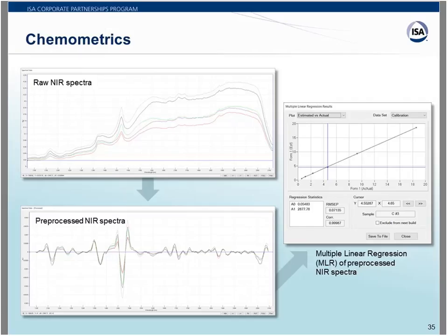These spectra might make no sense at first to someone who wants to quantify the moisture content during a manufacturing process, and it would probably be unrealistic to interpret the results since these spectra have different baselines and absorption intensities, which can be attributed to instrumentation parameters, sampling properties, etc. Or to put it simply, these spectra might look nothing more than a squiggly line for a novice spectroscopic user.